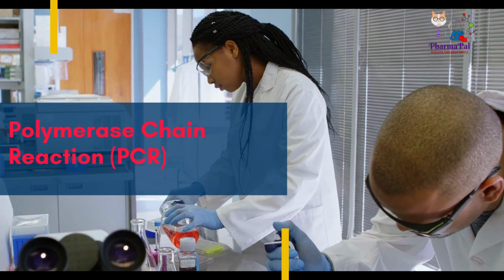The methodology of PCR is quite simple. Denatured single-stranded DNA sequences are copied by a DNA polymerase, creating duplicate double-stranded DNA. By repeating this process multiple times, we achieve an exponential increase in the number of copies of the starting sequence.